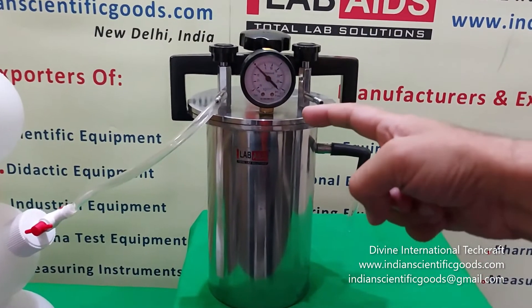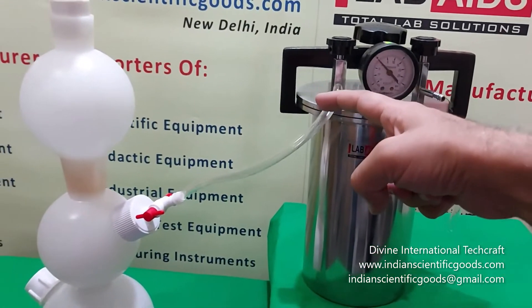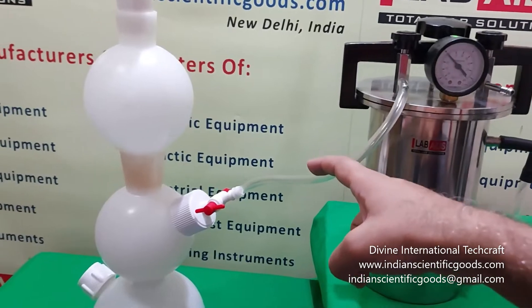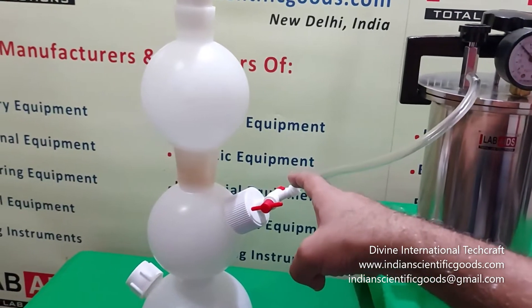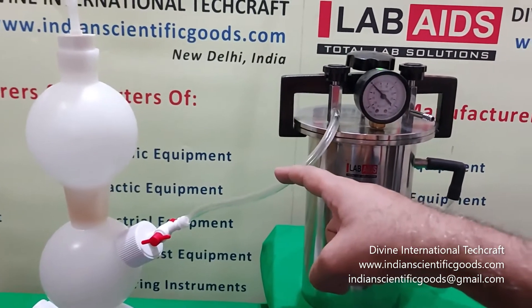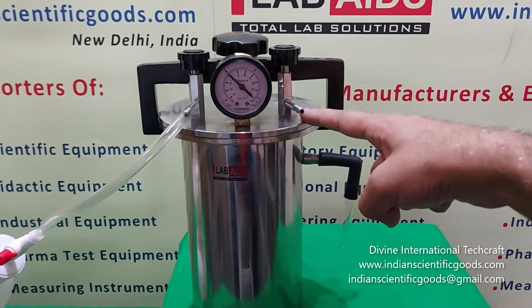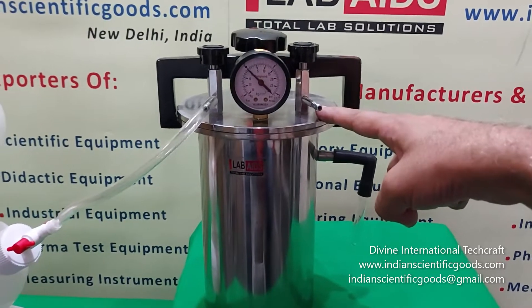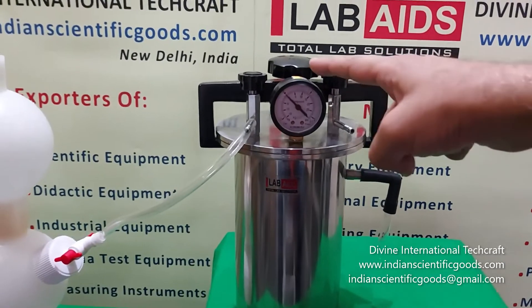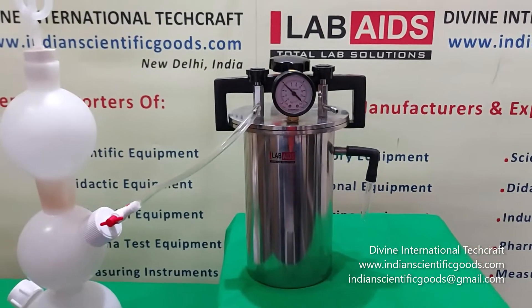Two needle valves are fitted on top of the lid. One valve acts as an inlet valve and is connected to hydrogen supply that may be generated in a Kipp's apparatus. Normally a Woulff bottle is placed in line to indicate hydrogen flow. The other valve acts as an outlet valve and is connected to a vacuum pump. A vacuum pressure gauge is provided on top of the lid to measure the internal pressure of the jar.